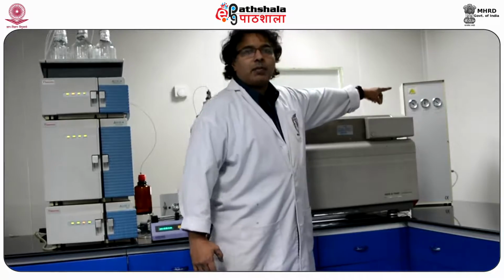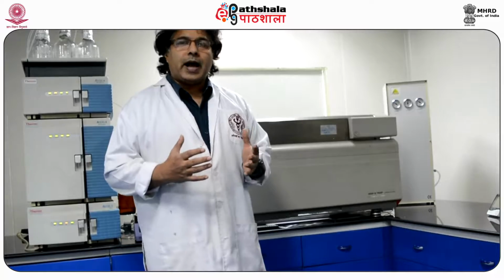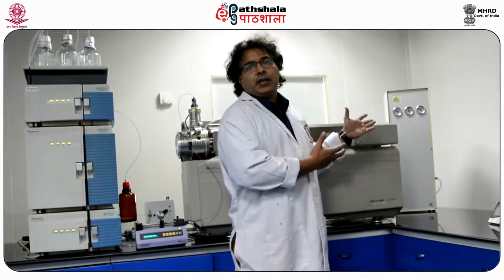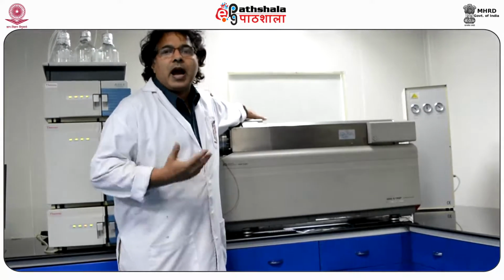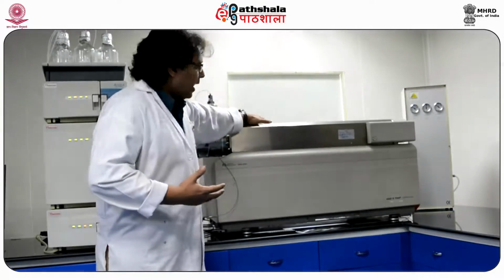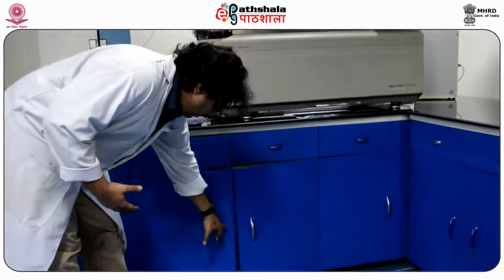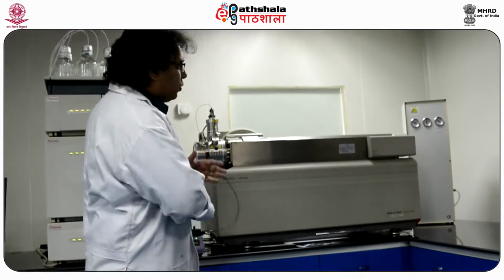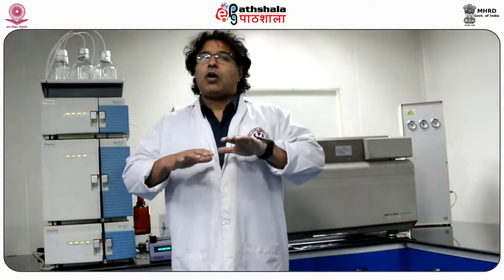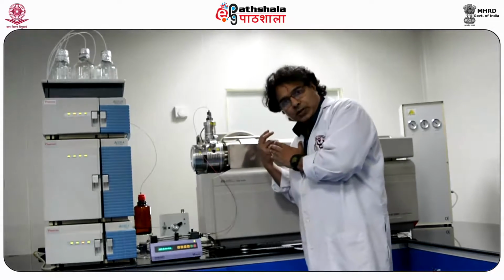What you see on the extreme left corner is the nitrogen generator, in which continuously from the atmospheric air, nitrogen is being generated. And nitrogen is supplied at various positions here. What you see here is the turbo pump, which tries to create a very high dynamic vacuum. This vacuum is continuously going on, and there is another instrument that is kept here, which is the vacuum pump, which is giving a static vacuum. Together, it tries to maintain the conditions which are essential for the traveling of ionized species inside this mass spectroscopy.